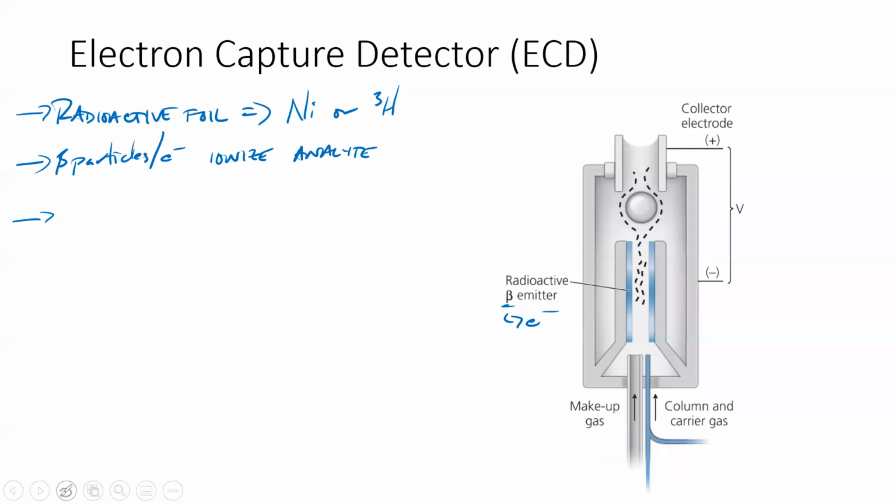This is good for, let me switch to green. Right. This is good for molecules that have electronegative functional groups.